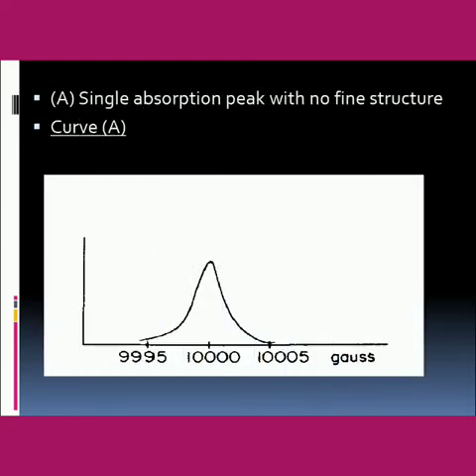A single absorption peak with no fine structure. So curve A is shown below. The curve A shows a peak, and no fine structure is seen in curve A.